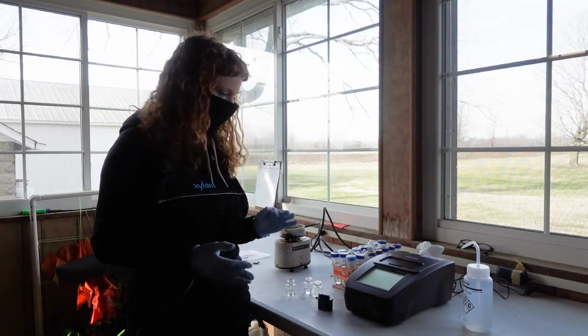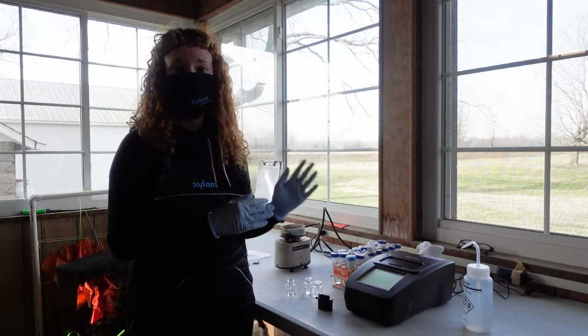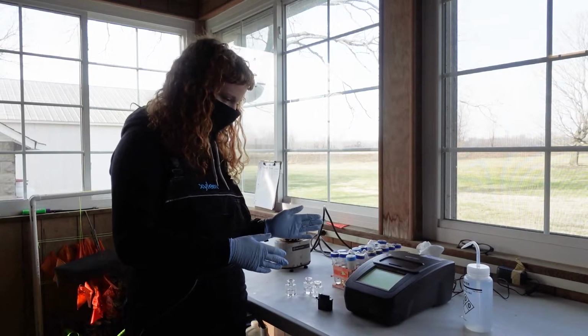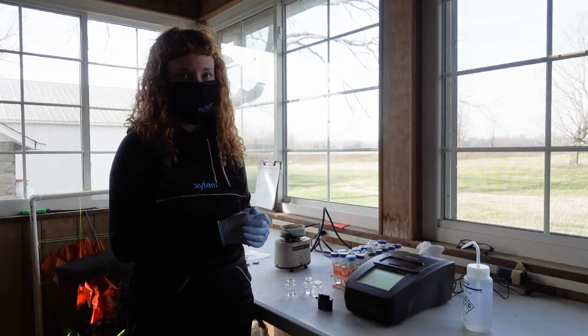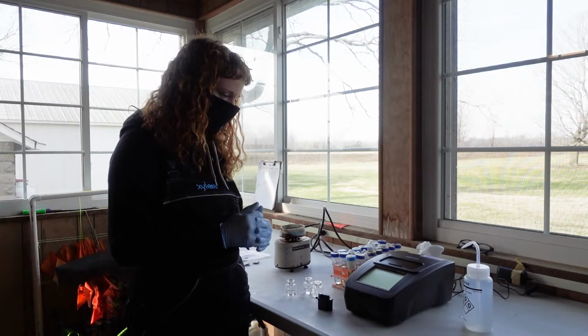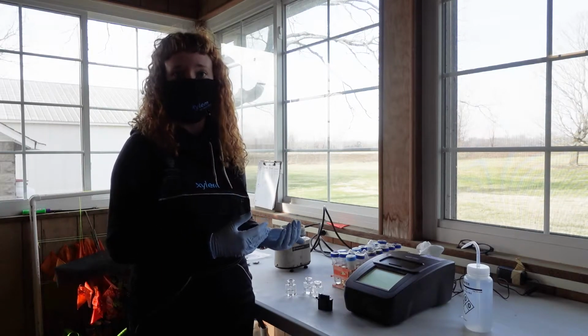So when you come in for the day, your instrument will be set up for you. It'll be set up to run the multi-wavelength program for nitrates measurement. The reason we do that is we're performing two absorbance measurements at 750 nanometers and 500 nanometers. We do that to compensate for the turbidity in the sample.